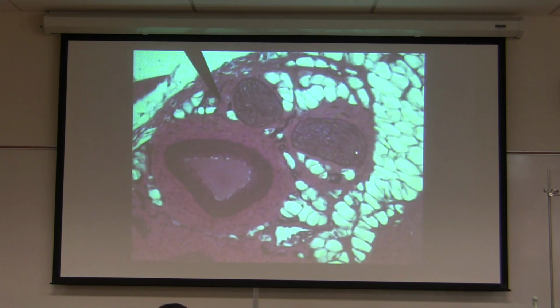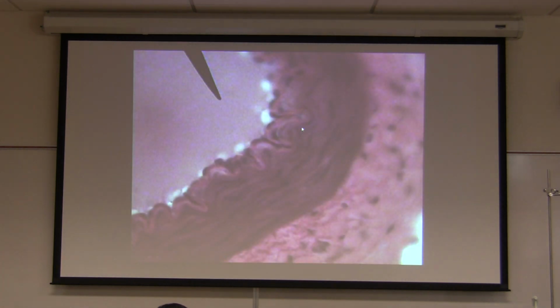Okay, I already showed you this, but we didn't have this one before. I was looking for this one. What is the name of the tissue? Endothelial. Is that right? Single layer. It's a blood vessel. A single layer of simple squamous epithelial tissue in any blood vessel in the body, artery, vein, anything, and also the heart. It is endothelial. And of course, what is the name of the tissue?